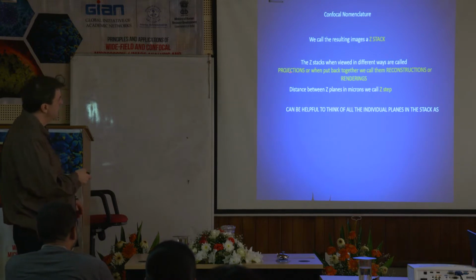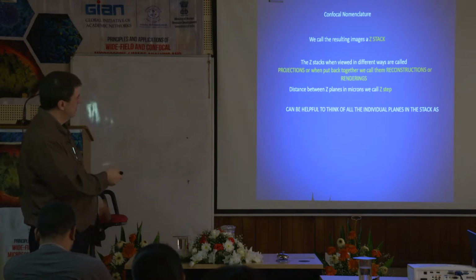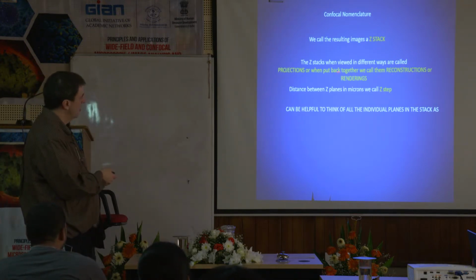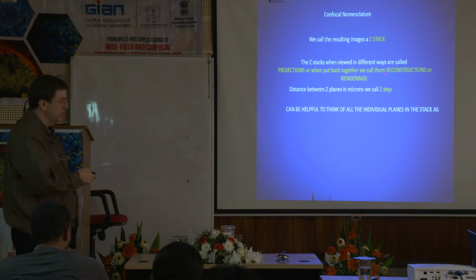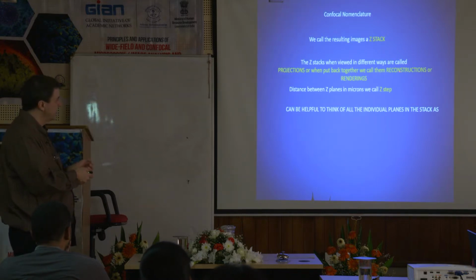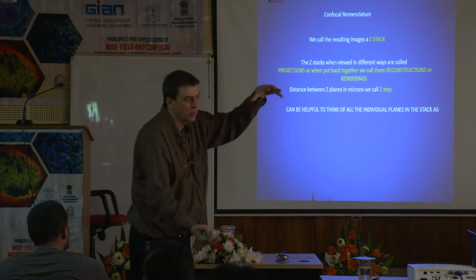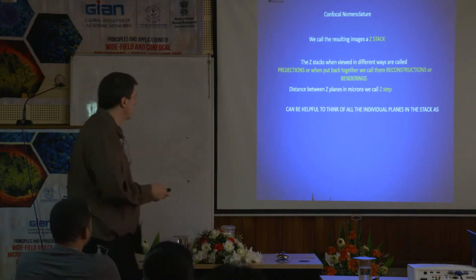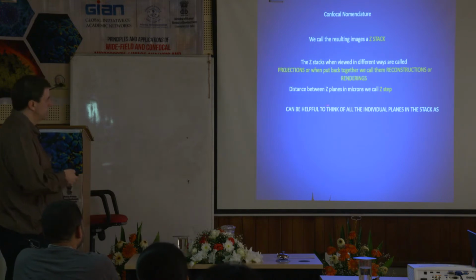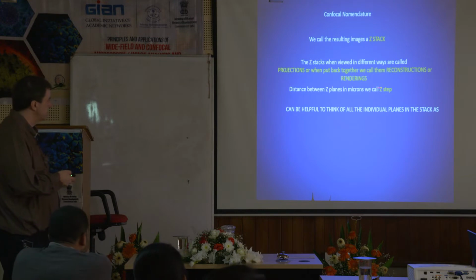Anytime we take those different planes and put them back together in 3D to rebuild the ball, we call that a reconstruction or a rendering. So if you hear me use these terms, projections, which is looking at the ball from different angles, reconstructions, think about it, it's a perfect word for it. We have reconstructed the ball. We have made the ball whole again. Or sometimes instead of reconstructions, we call that a rendering. And again, the step is called a Z-step.